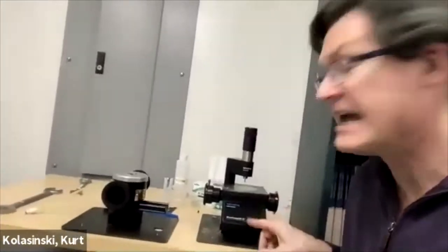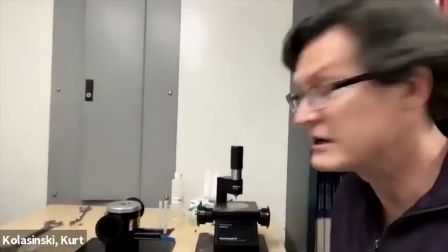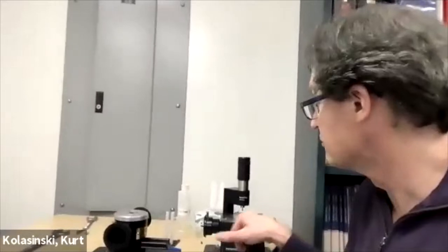Now, there are several attachments for the infrared spectrometer. There is the ATR, attenuated total reflection, the multiple internal reflection cell. There's a diamond prism down here. The infrared light comes in the side, bounces by total internal reflection through that prism.